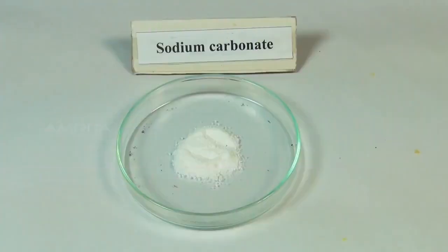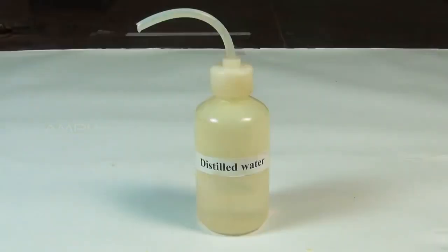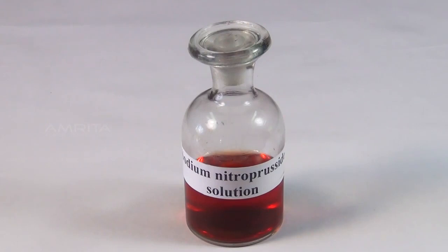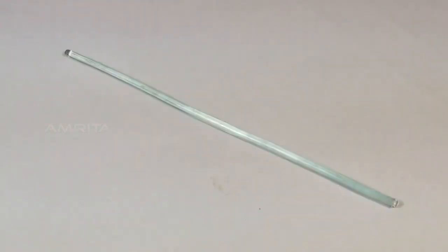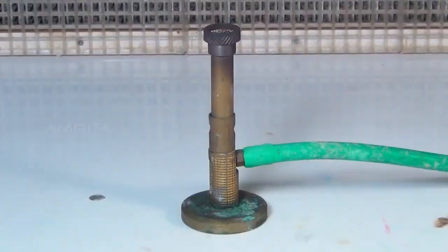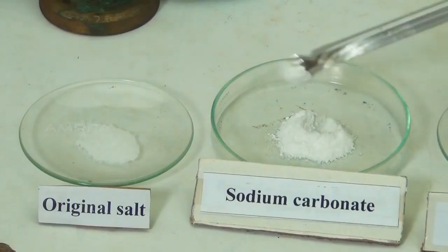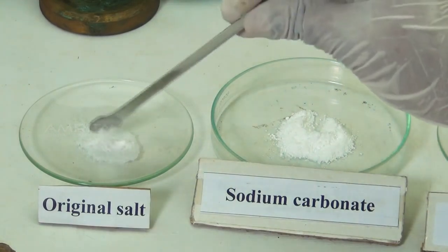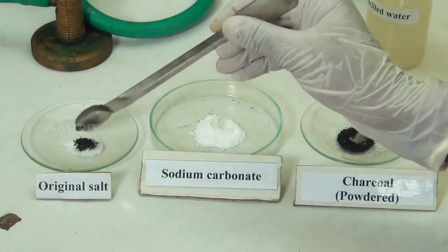Materials required: original salt, solid sodium carbonate, powdered charcoal, distilled water, sodium nitroprusside solution, watch glass, spatula, glass rod, wooden splinter, china dish, and Bunsen burner. Procedure: take a small amount of the salt in the watch glass. To this, add a small amount of solid sodium carbonate using a spatula. Then, add a little powdered charcoal using another spatula.